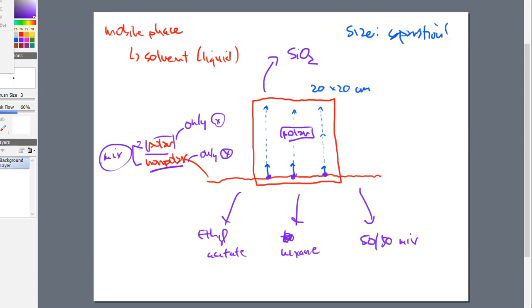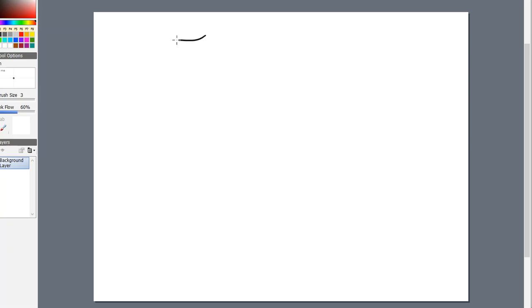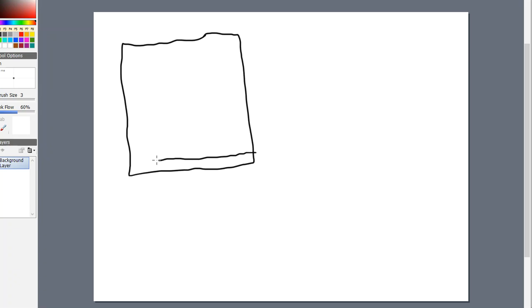At the end of this lab experiment, what will happen? What do we see? Well, we'll see a plate and there'll be a starting line where I'll put my spots. And my spot, hopefully, will travel up, my component will travel up the plate so far. And then there'll be a finish line up here. And this will be the area where my mobile phase stops. All right, so this is the finish. My mobile phase will get sucked up through the plate and it will continue to travel up, up, up, up, up until I take it out. All right, so there's my finish line.